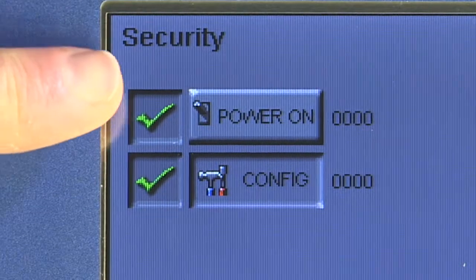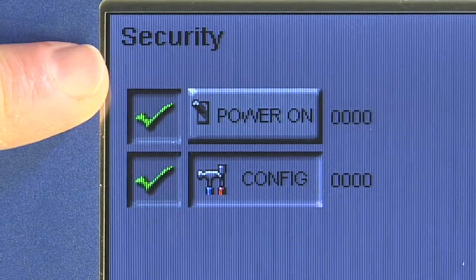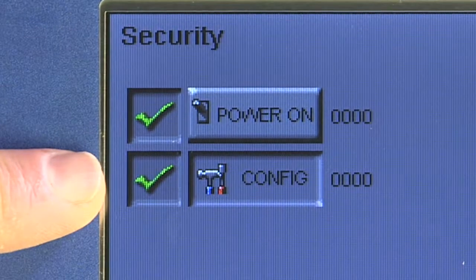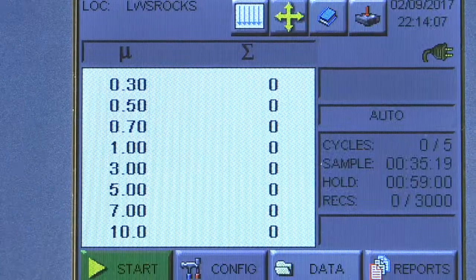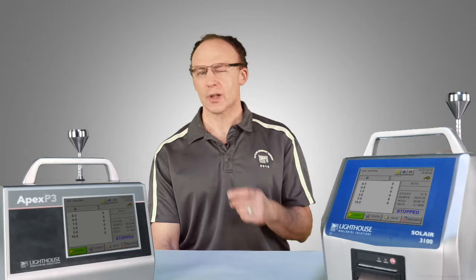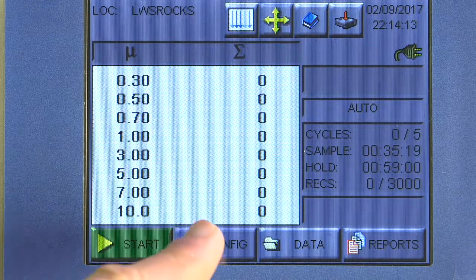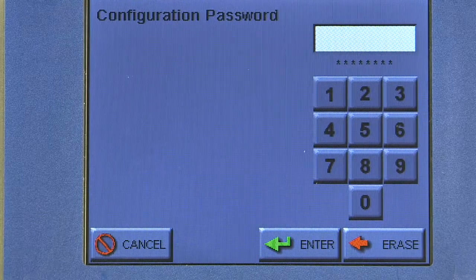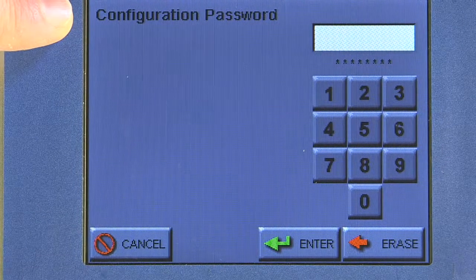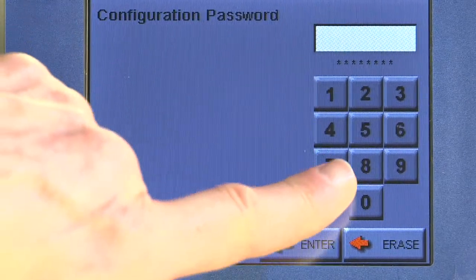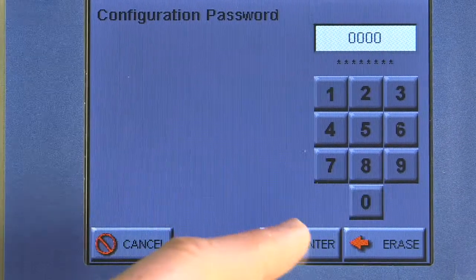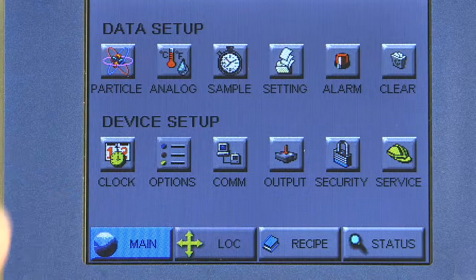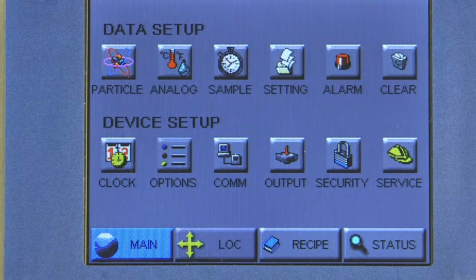So now I've set a power on password and a configuration password. If I go back to the main screen and decide I want a longer sample and I hit the configuration button, you'll notice the first thing that comes up is the configuration password prompt. I enter zero zero zero zero and hit Enter — now I can get into my configuration screen.